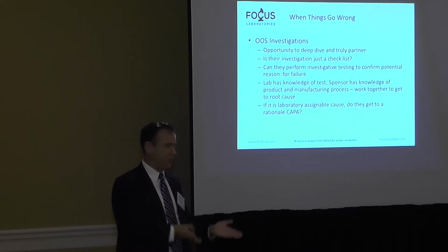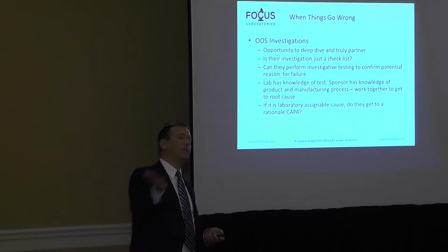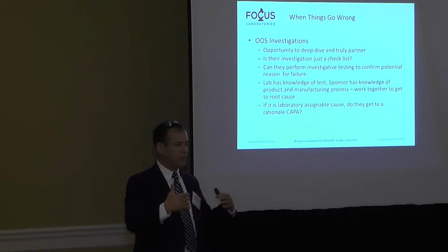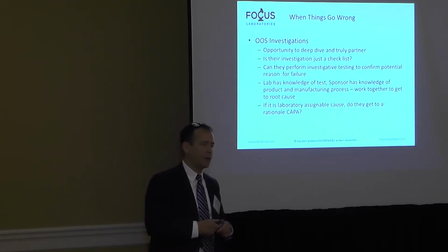That's the easiest thing to do. I made a mistake, you don't have to recall this product. We couldn't find a reason. So we said, come on over. Help us with this investigation. Come over and take a look at what we're doing. Maybe together we can figure this out. And sure enough, they pointed out a few things that we really weren't doing optimally. Sterility testing is a lot of first air and a lot of technique, and there were some things that maybe we could have done better, but I did not see them as an assignable cause.